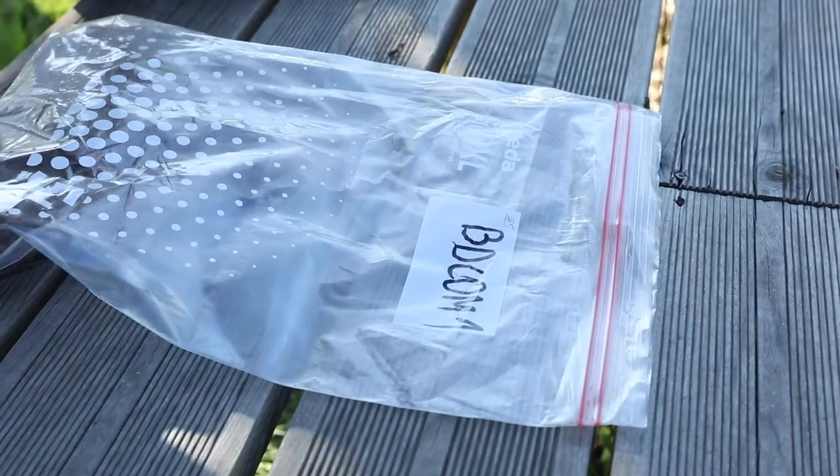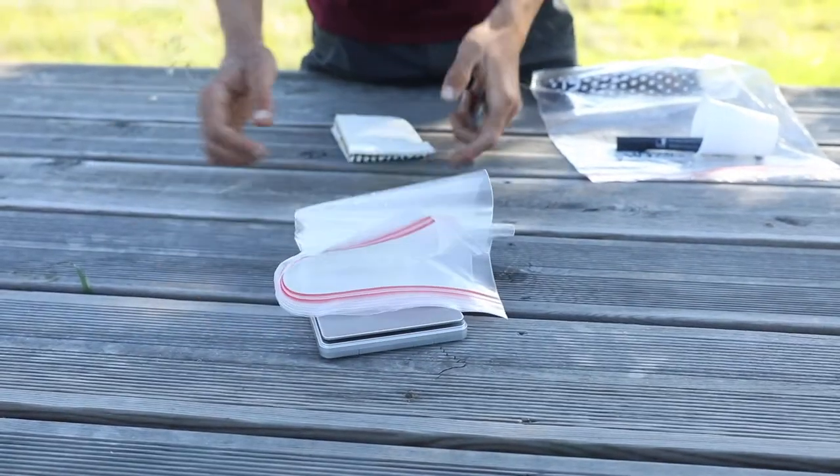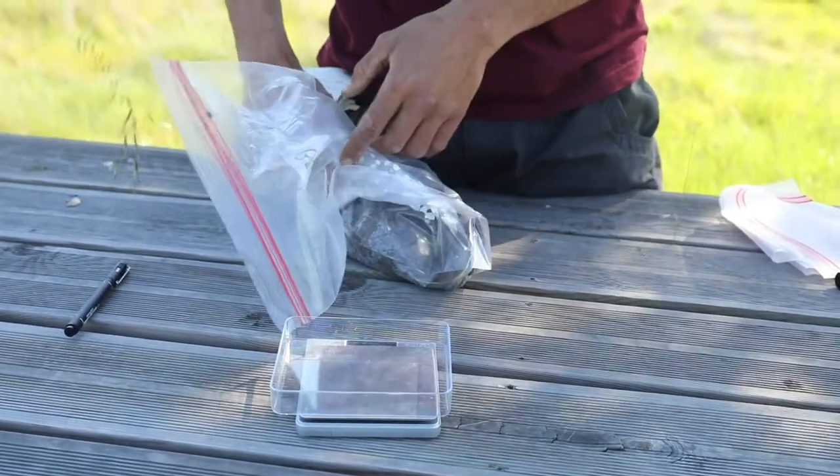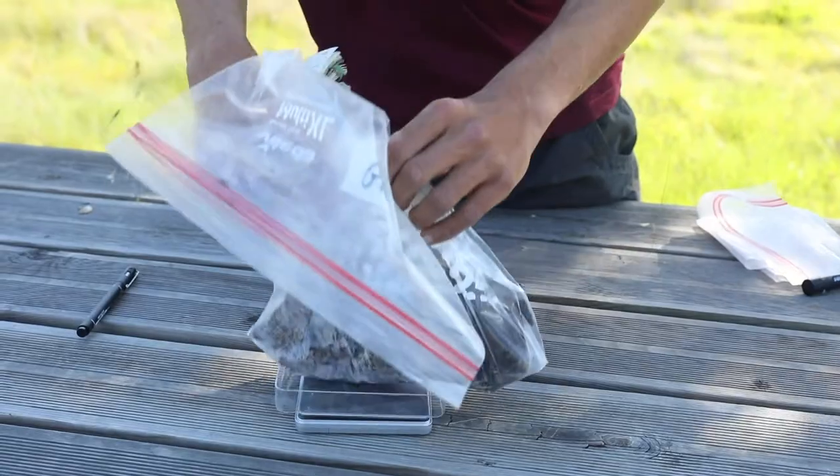We then weigh an empty plastic bag and record its value on the datasheet. We do the same for the soil sample in the bag and also record this value.